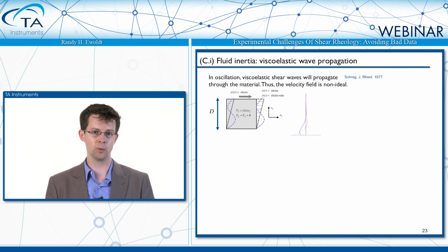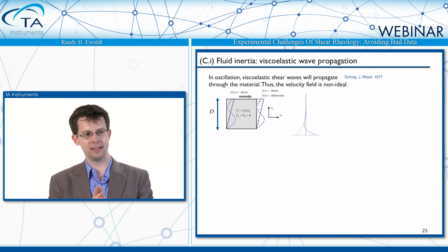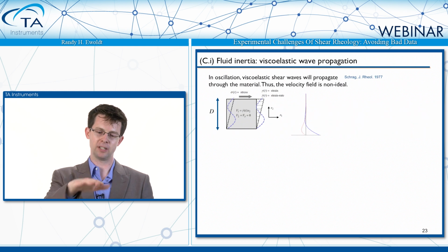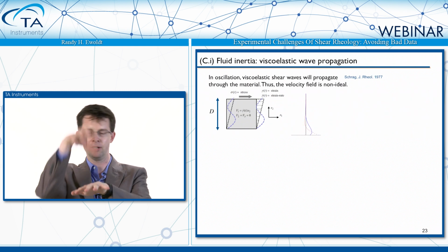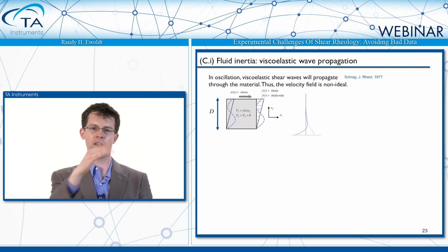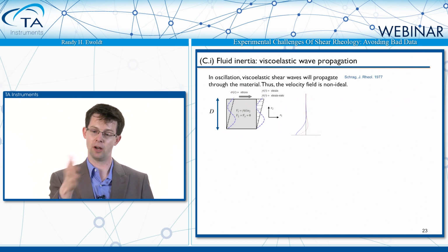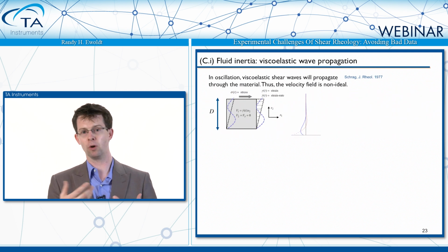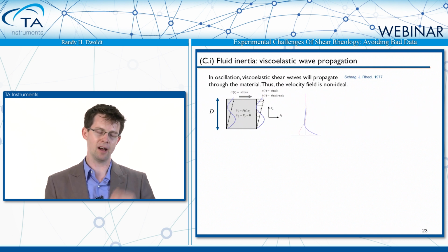So what does this look like in a real instrument? You may remember if you've solved the mathematical problems like this, if you model real materials, if you, for example, have a slab of material and at the bottom you have a flat plate, like a jello plopped on top of a plate, and if you oscillate the plate back and forth, the jello will wobble back and forth. What you're seeing is the density of the jello that's causing it to wobble back and forth. And if it's more stiff jello, it will wobble a little bit faster in response.